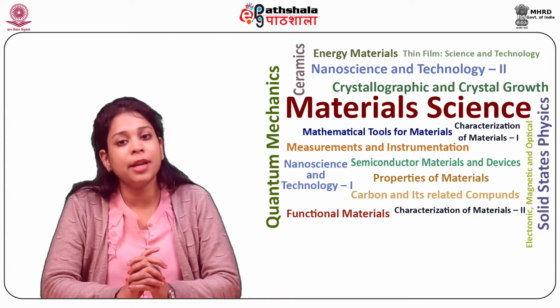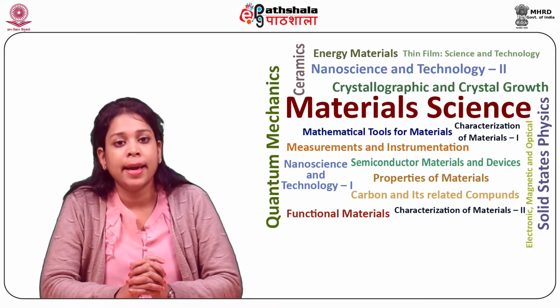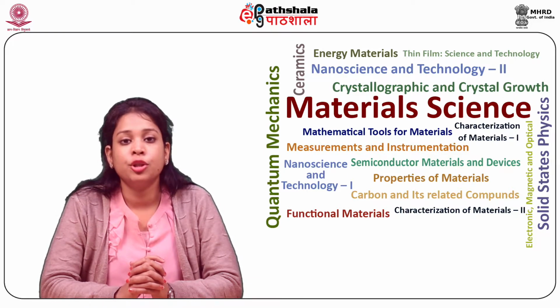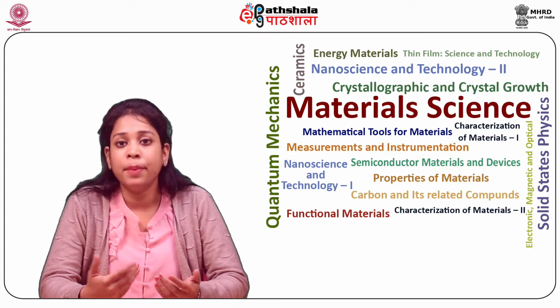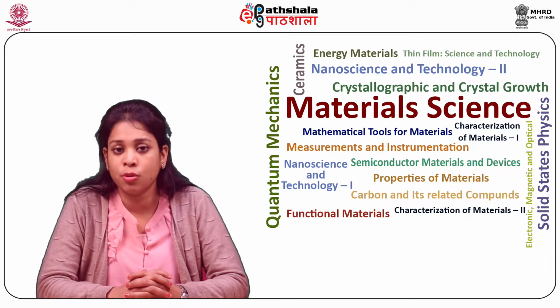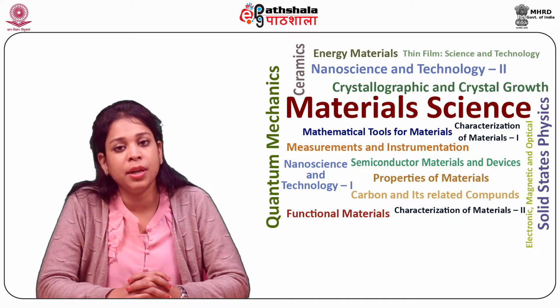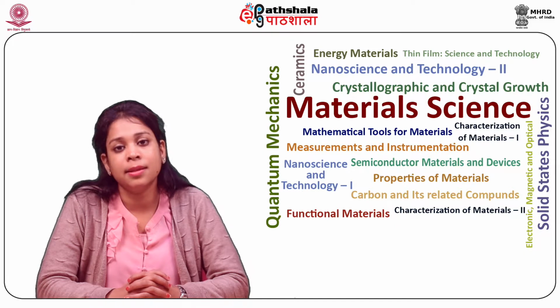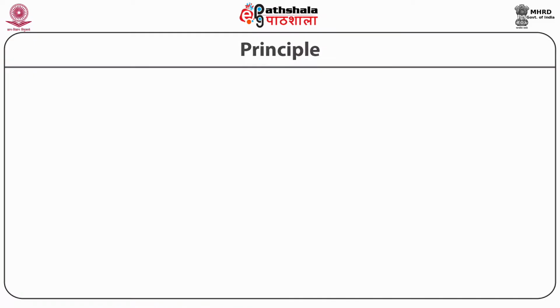NMR provides spatial information by applying magnetic field gradients. This module will offer the basics of nuclear magnetic resonance spectroscopy along with a brief review of recent advances. So let's discuss it. So students, let us discuss the principle of NMR spectroscopy.